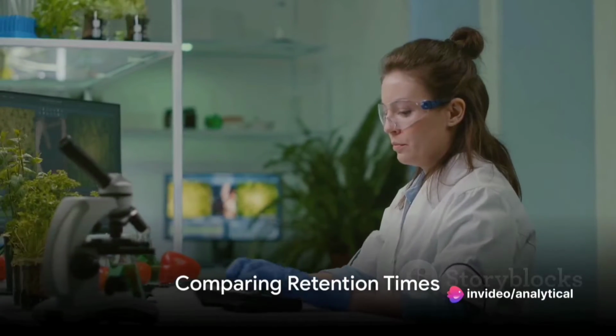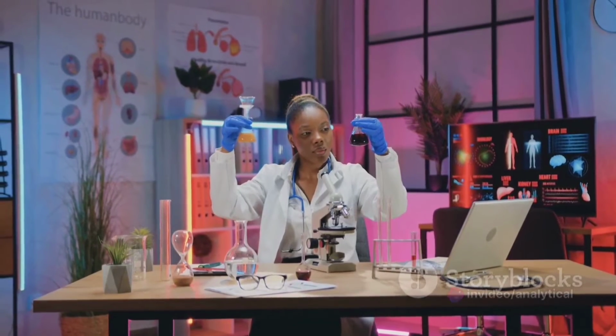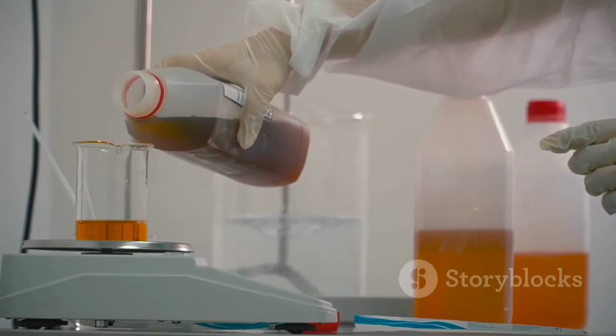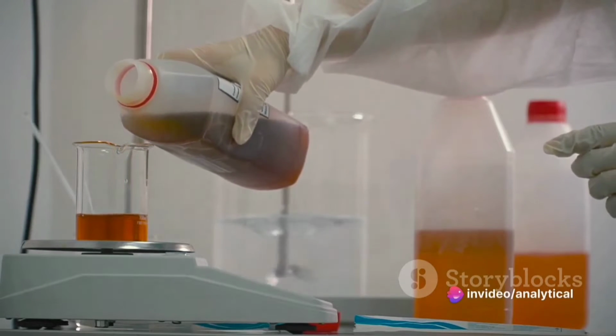Consider two compounds, A and B. If compound A has a retention time of 10 minutes and compound B has a retention time of 15 minutes, it means that compound B takes longer to travel through the column and reach the detector compared to compound A.